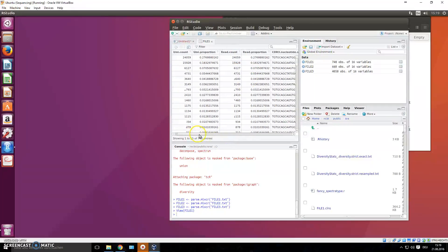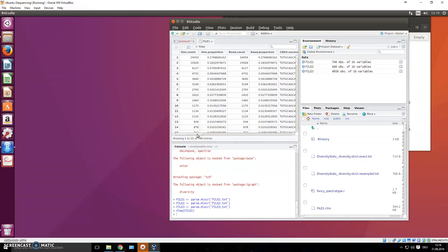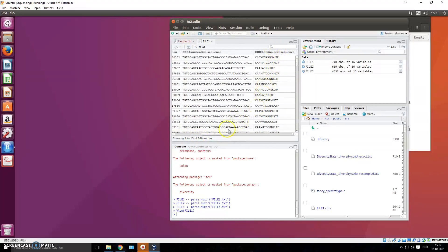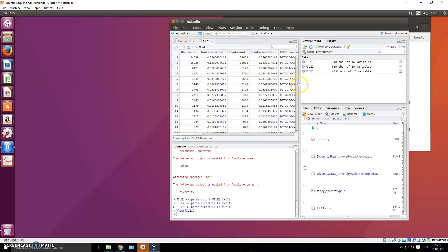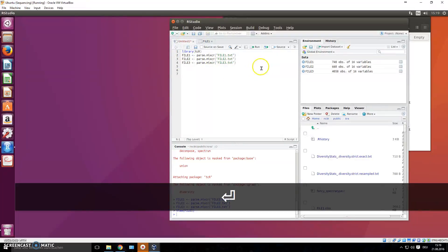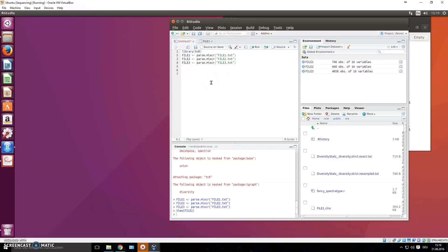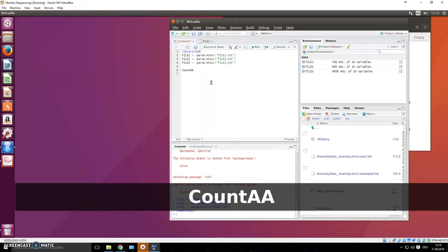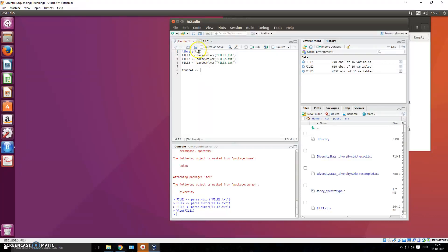Let's say I want to present a list to my supervisor at a lab meeting - just the count and amino acid sequence from these files. I want a separate object with just those two columns. In the text editor, first assign the result to an object - let's call it count_aa. We assign the following command; this has nothing to do with the TCR package, we just used TCR to parse our files into this format.